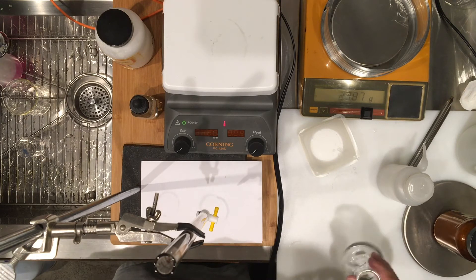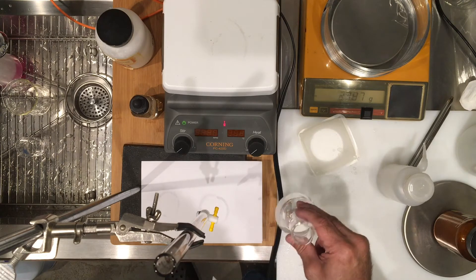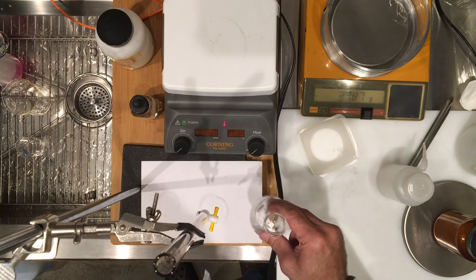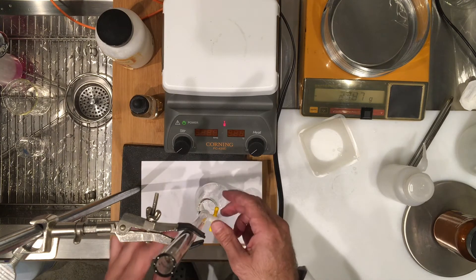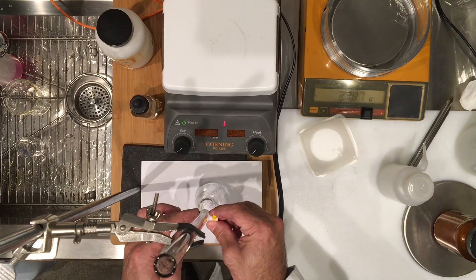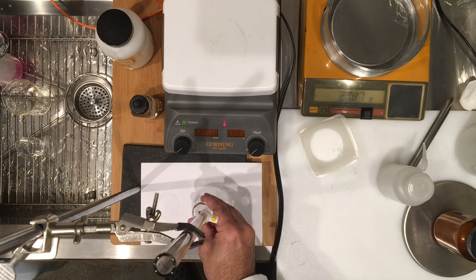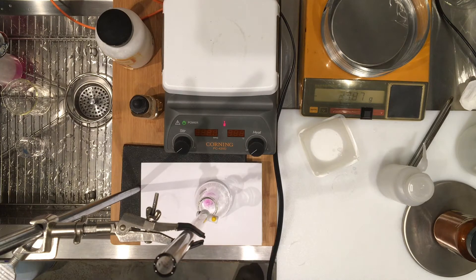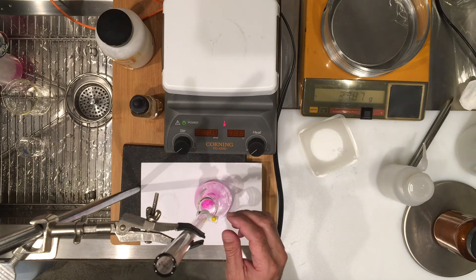Right now I know that the last titration took 20.3 milliliters, and this titration should take at least 20.3 plus more sodium hydroxide. So I'm going to just pour in 20.3 or roughly 20.5, and then we're going to add the remaining drop by drop. This is going to speed up our other titrations.